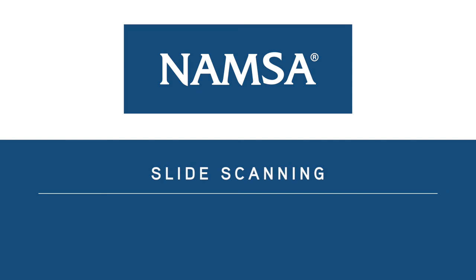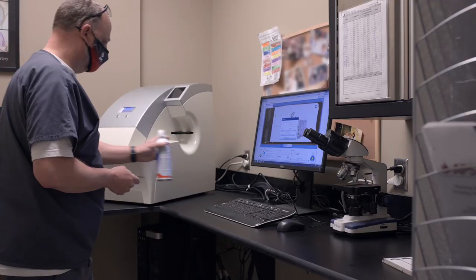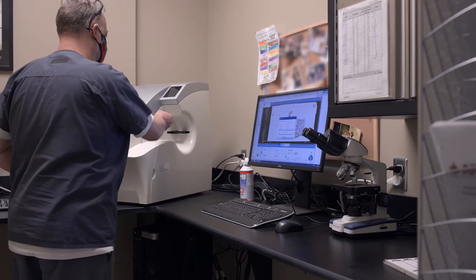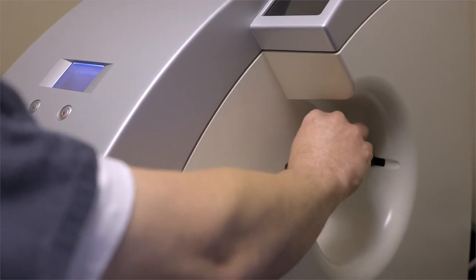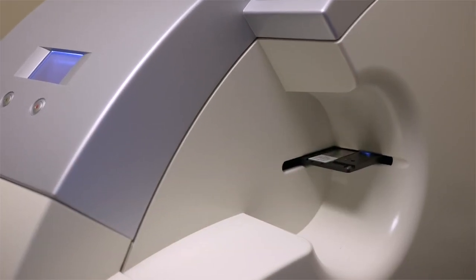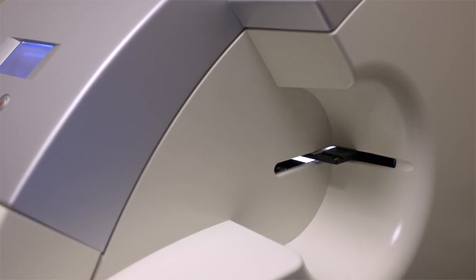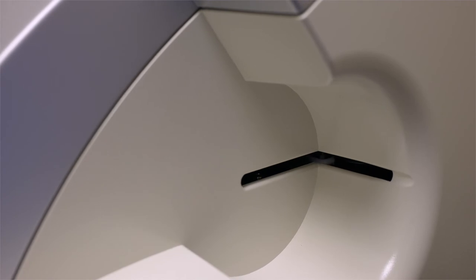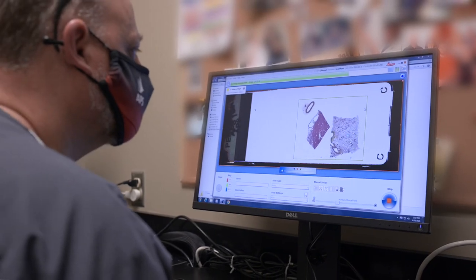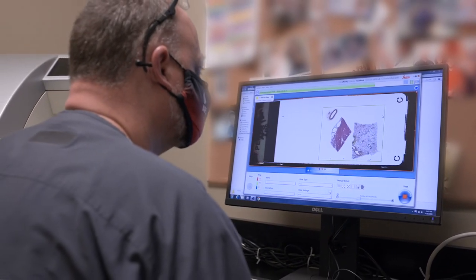Slide Scanning. Once slides are created they may be scanned for digital or physical delivery. Whole slide scanning of both paraffin and plastic slides is performed at a magnification of either 20x or 40x. Read-only discs of these images can be provided to the client for remote viewing.